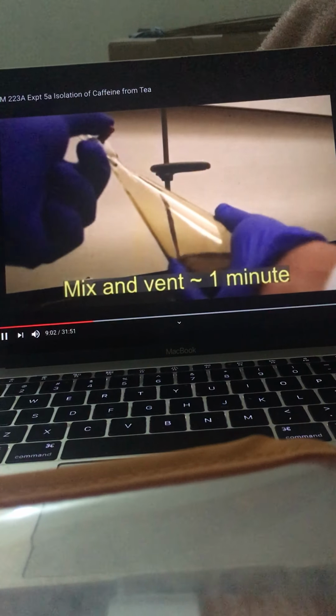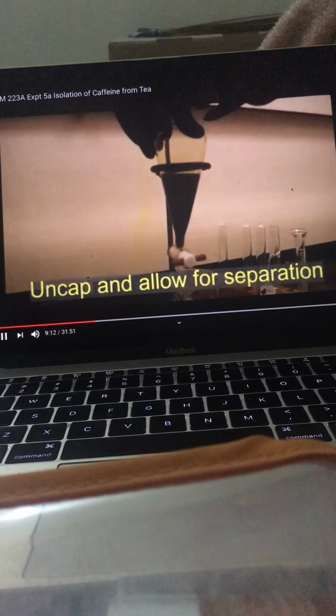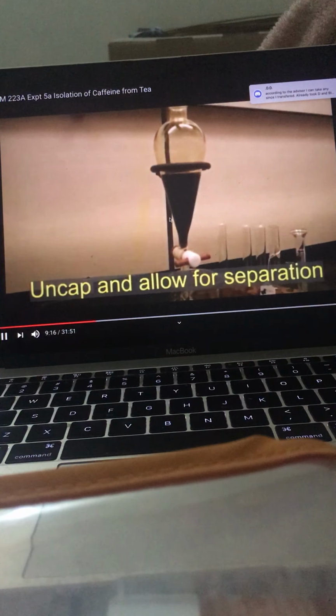Done a couple of times to mix and then vent, and turn it back on its right side. Wait for the separation and the settling, and you'll see the 2 layers form again.